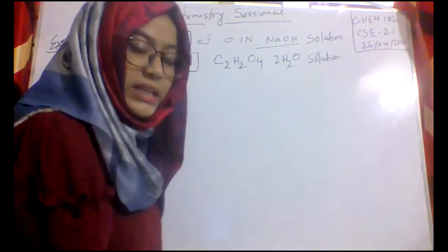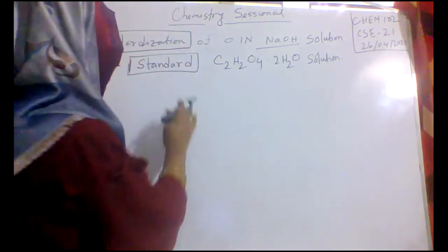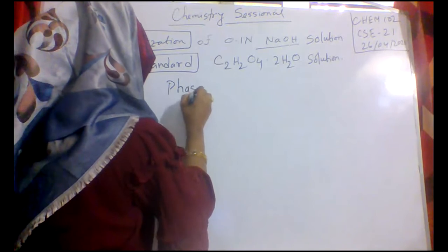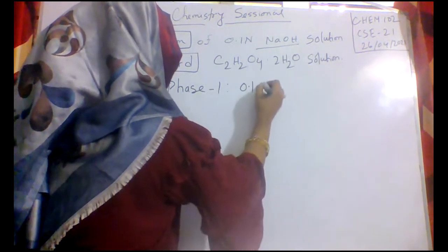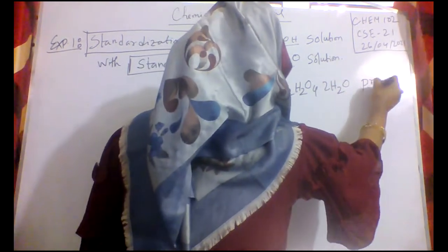If you don't understand anything, you can ask me, I will repeat. So in phase 1, 0.1 normal oxalic acid preparation.